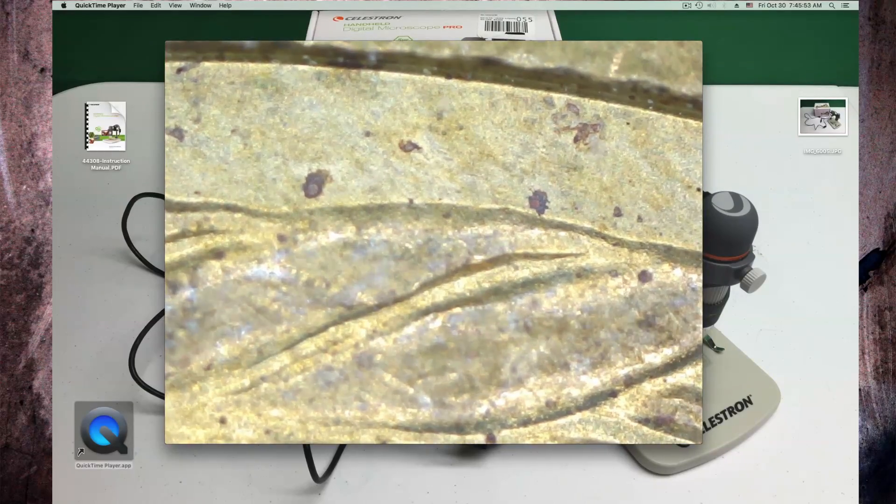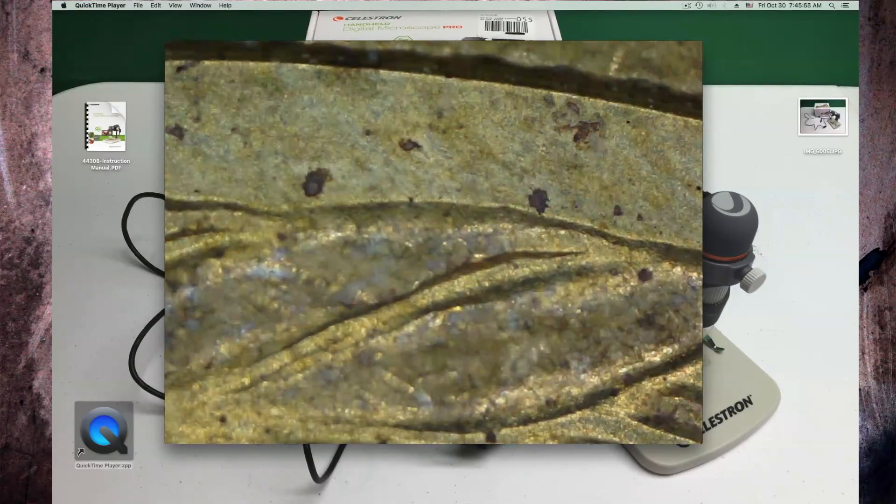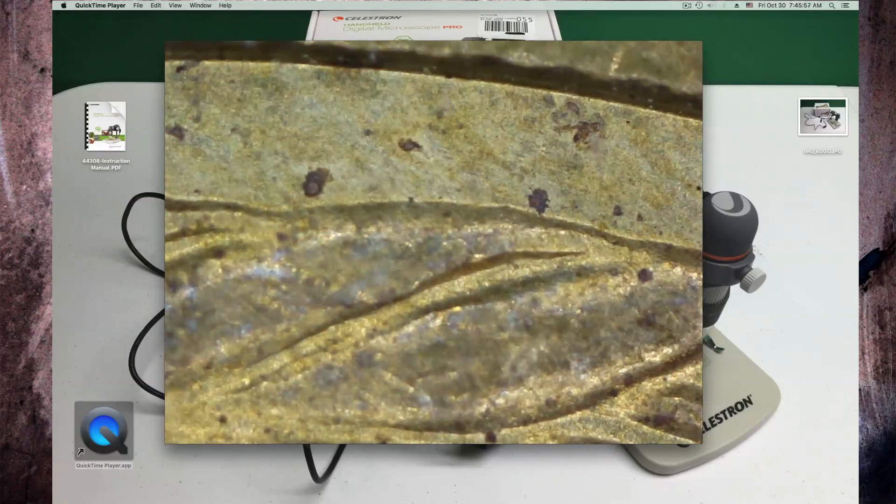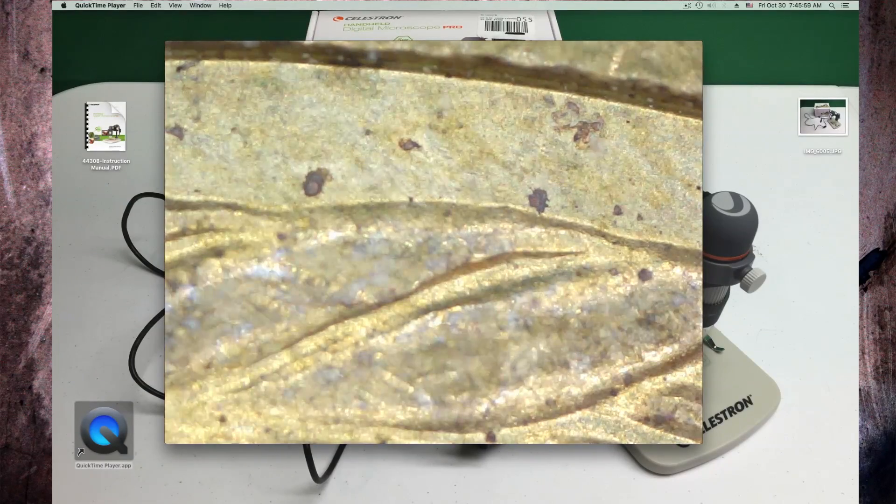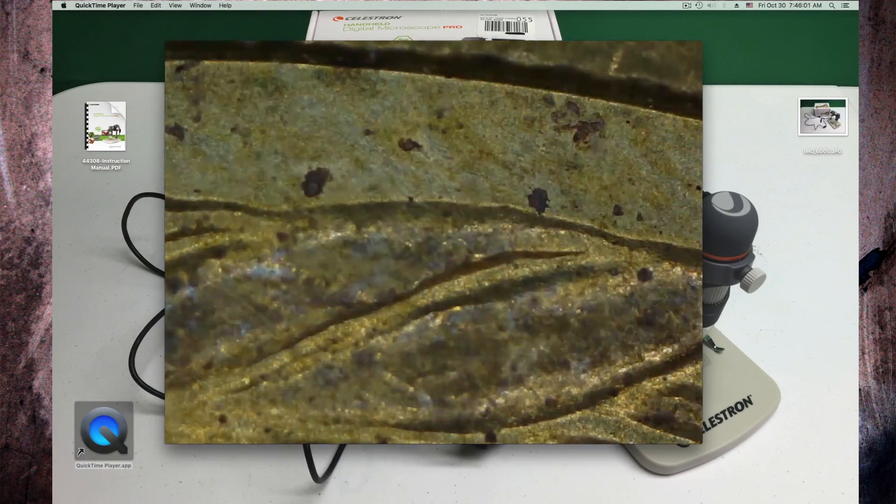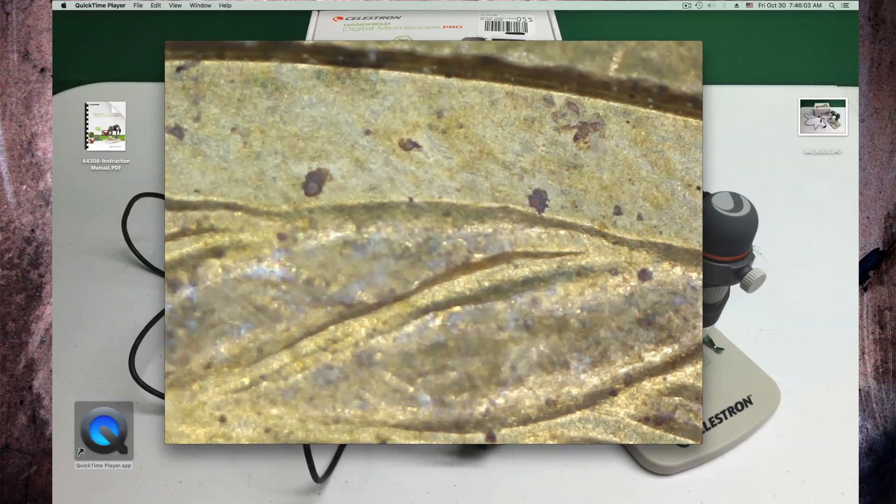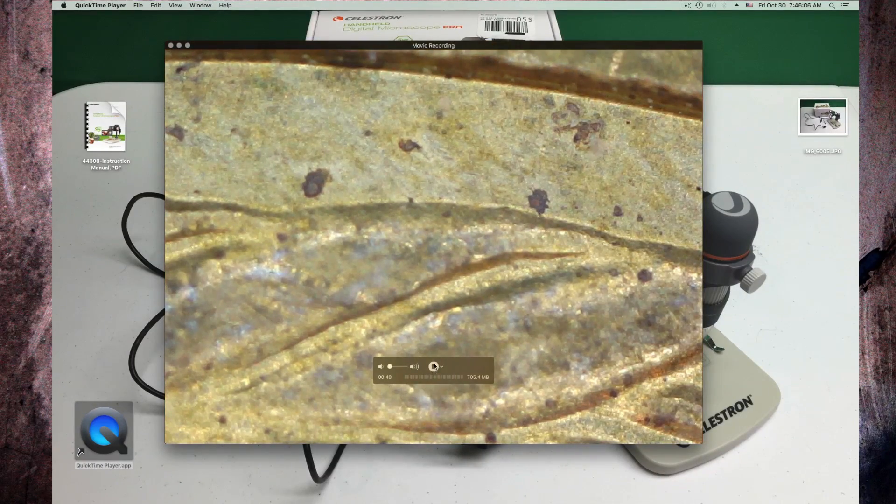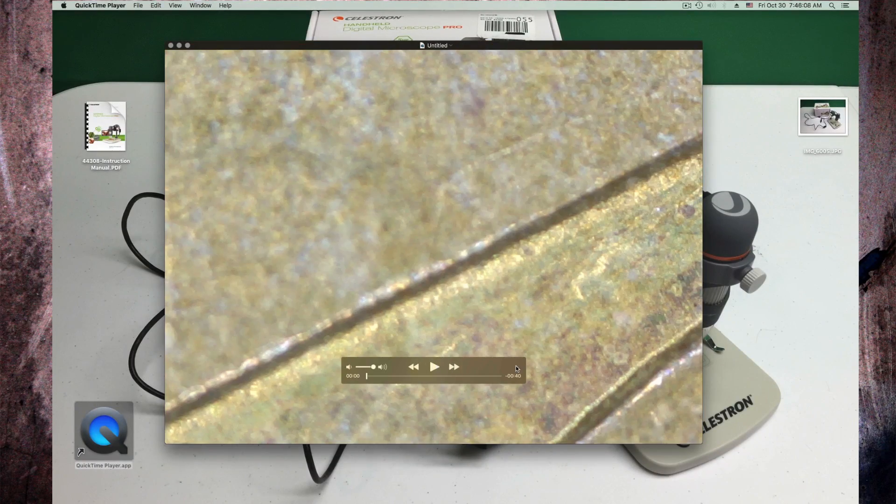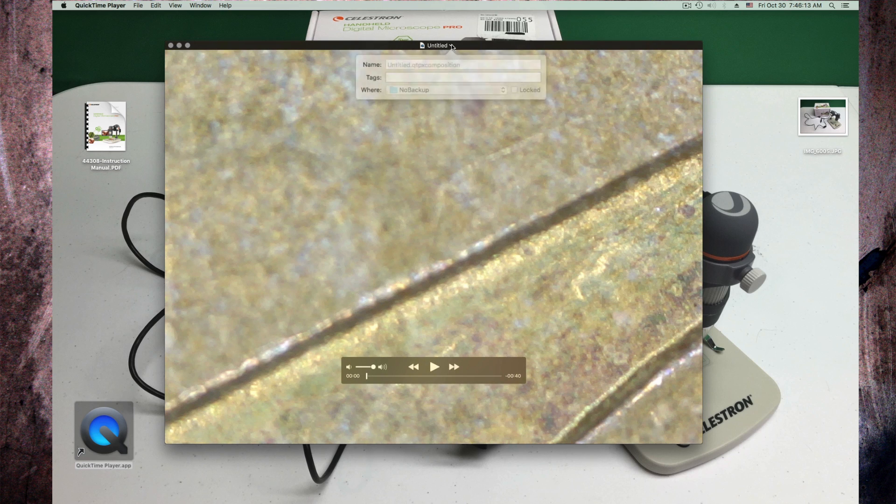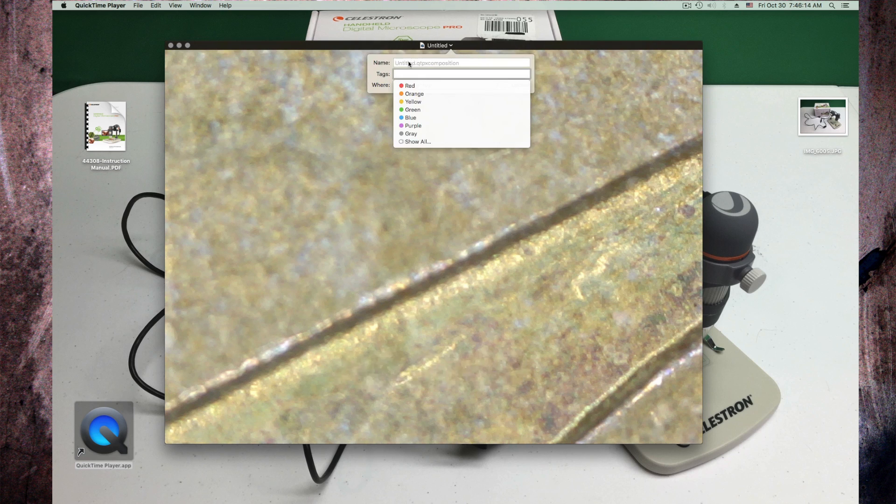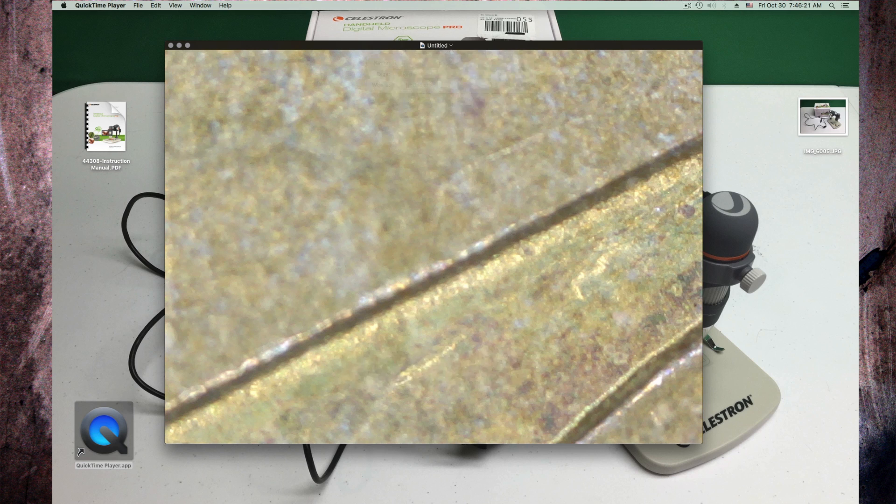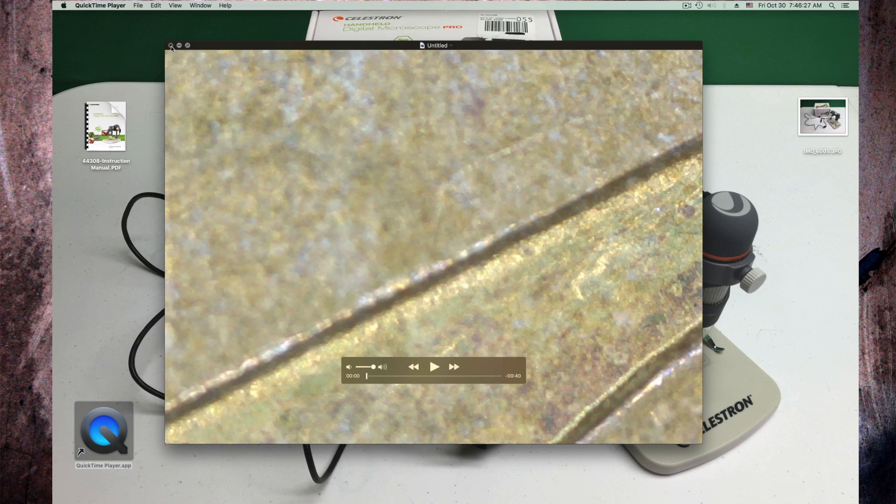On the dimmer we can change the light. It flickers really like this. This is full brightness. And less. Stop. And then this was 700 megabytes. And then we just save this thing. Let me give it a name here. So we can save this.